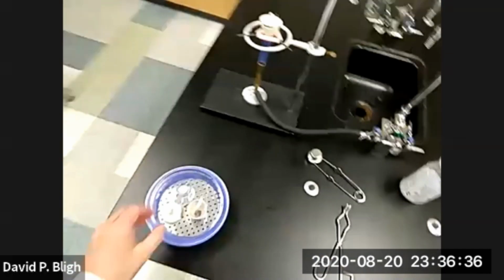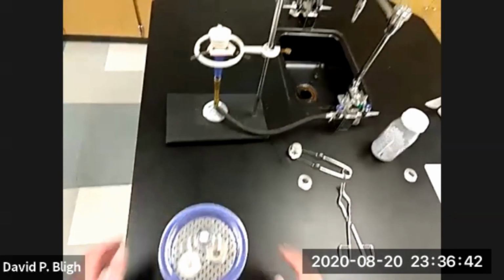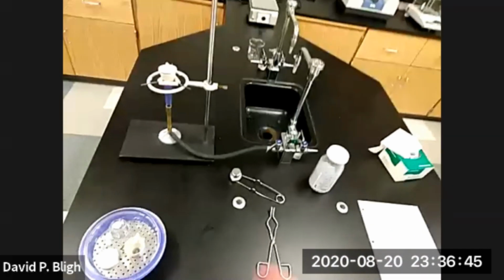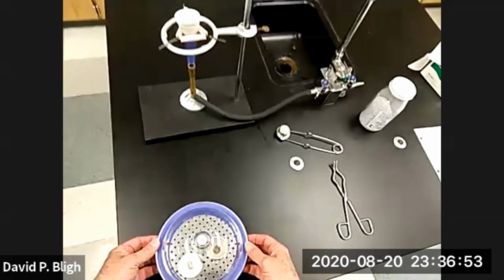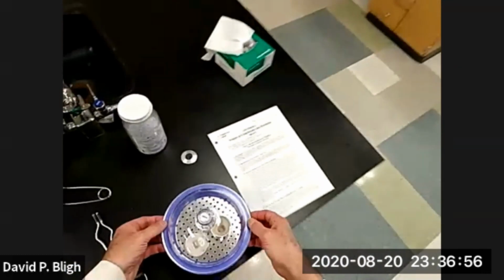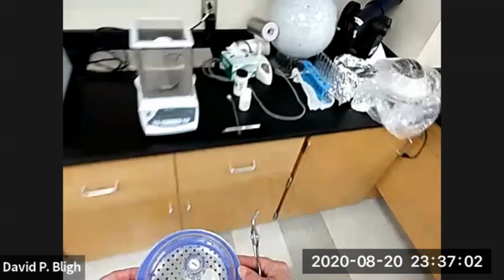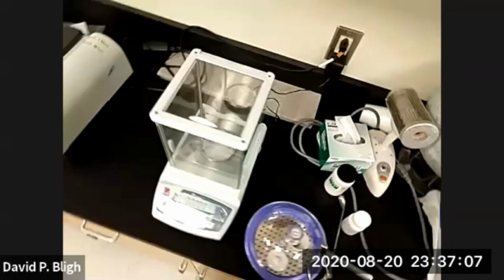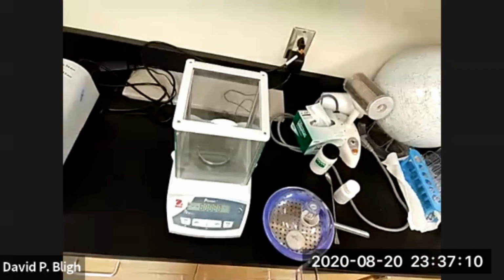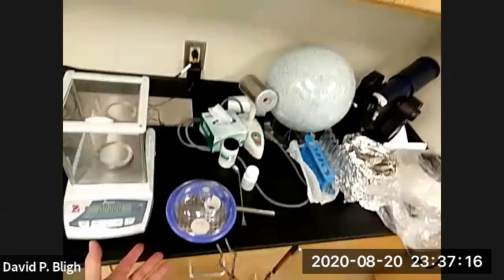Okay, let's see. If we feel that, it's very warm. So my guess is that it's going to drift. But in the interest of time, I'm willing to put up with a little bit of drift, and we'll deal with that. All right, so let's carry the crucible over here with our tongs to the balance. There. The balance is zeroed. Right? You just push the tare button. It's zeroed. Now, what do we weigh?